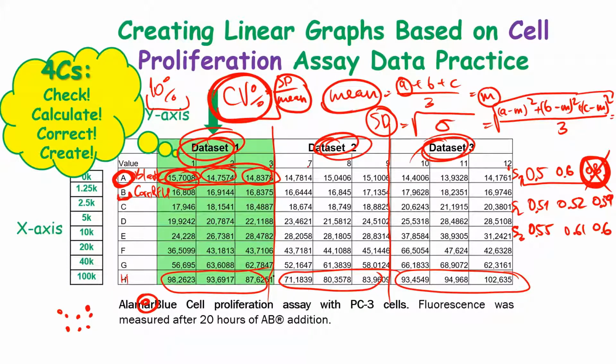If you look at these 2 data sets only, the mean is very close to 95 or 93. And this guy is already 13 points away from the mean. This guy is even more, like 22 points away. So this might be a real outlier for the whole condition.